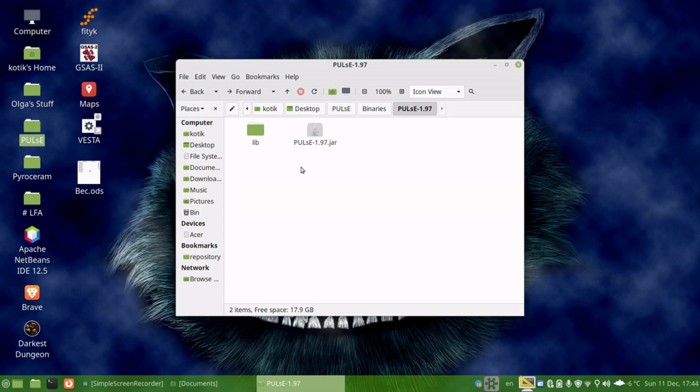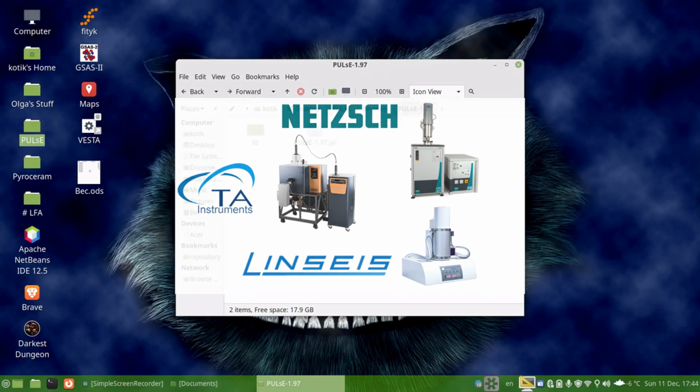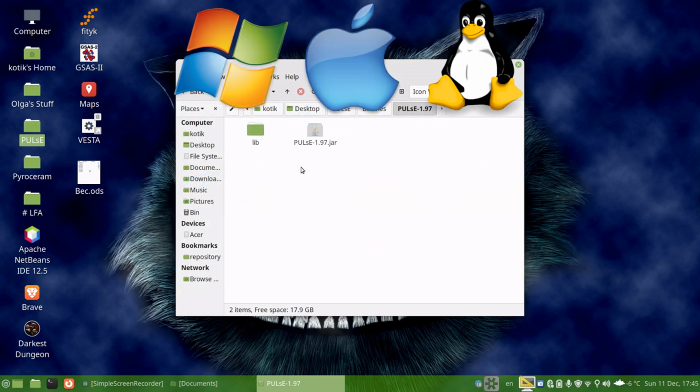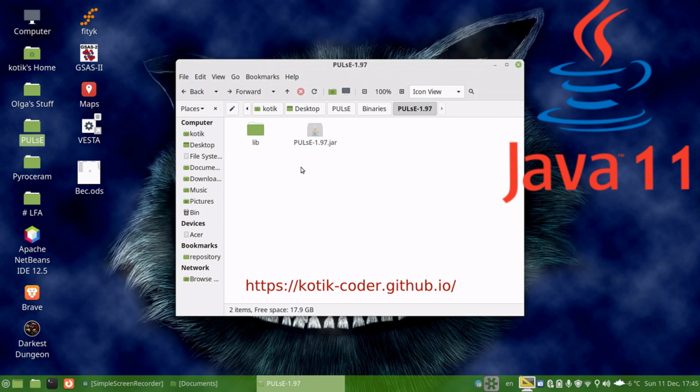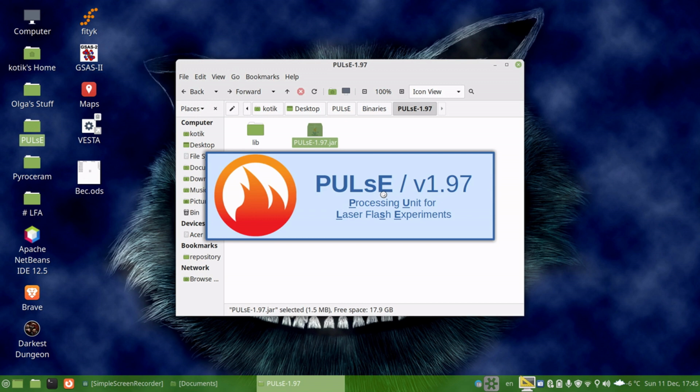If you are watching this video, you're probably familiar with laser flash analysis and the challenges users are facing. To help you out a bit, I have developed this cross-platform open source software which you can download from the PULsE website. If you have Java 11 installed on your operating system, it's easy to run it by just double-clicking on this jar file, which opens a splash screen with the logo and the version number. It takes some seconds to load.